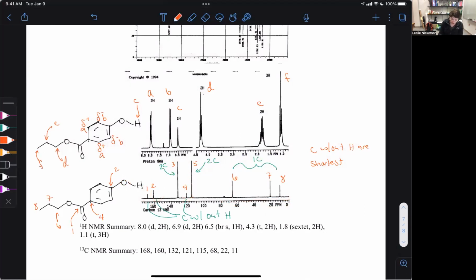Because we are next to a delta plus here, but this carbon being right next to oxygen is getting a direct electron withdrawing effect because the oxygen is electronegative. Yes, it is donating electron density in, but it's mostly landing over here, like 1 away. All right, so then we have to figure out 3 and 5.